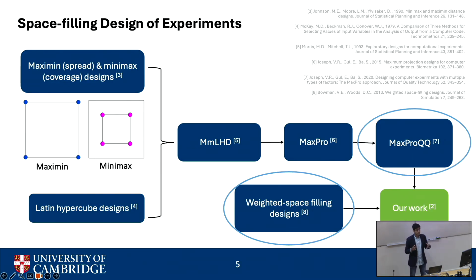because the objective of this work, unlike the previous talk which was discussing Bayesian optimization, was to collect as informative a data set as we could to then be able to build the forward model for the property prediction. So with the space-filling design, where you're trying to be as representative and sample all of the design space, then when you develop models and machine learning predictions over these, the predictions should ideally be close to some other point that you sampled or was in your data set.